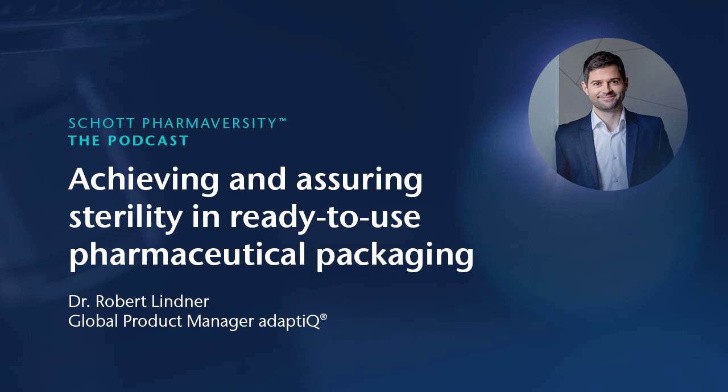Today, our focus is the very important topic of sterility, particularly in the field of ready-to-use primary packaging. My name is Carolyn, and today with me is Dr. Robert Lindner. With him, I will talk about different aspects that you should be aware of when handling sterile primary packaging. But before we start, let me shortly introduce Robert to you.